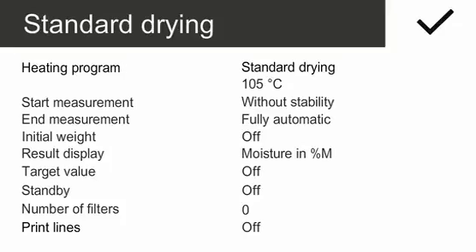In this quick guide, you will be guided through the moisture determination of a pasty sample, such as ketchup. To perform the analysis, you need to adjust some of the parameters.